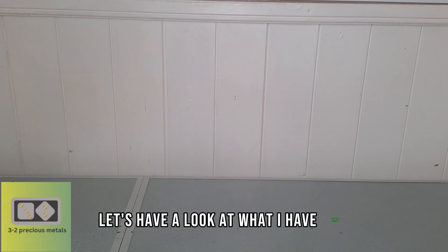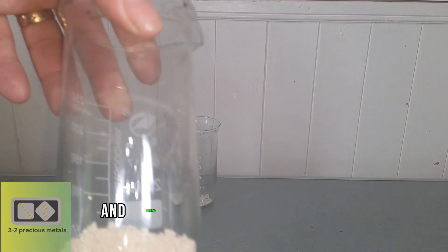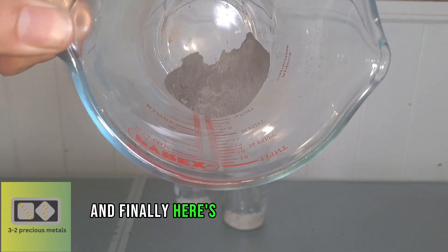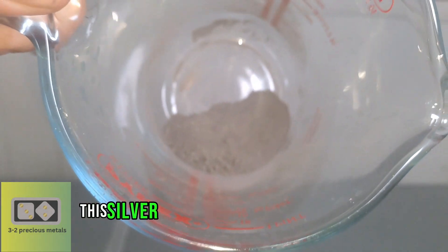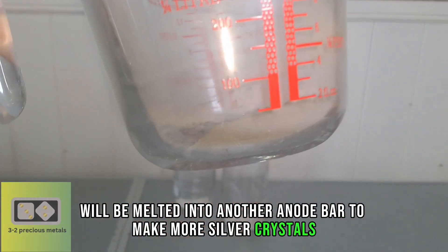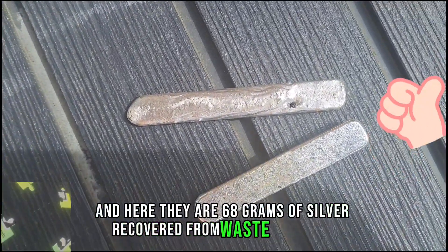Let's have a look at what I have left. Here's the silver crystals that I will add to my next batch, and here's the silver powder that I dropped with the copper coil at the start of the video. And finally, here's the silver from the silver chloride. This silver, along with the silver dropped with the copper coil, will be melted into another anode bar to make more silver crystals. And here they are — 68 grams of silver recovered from waste solutions.